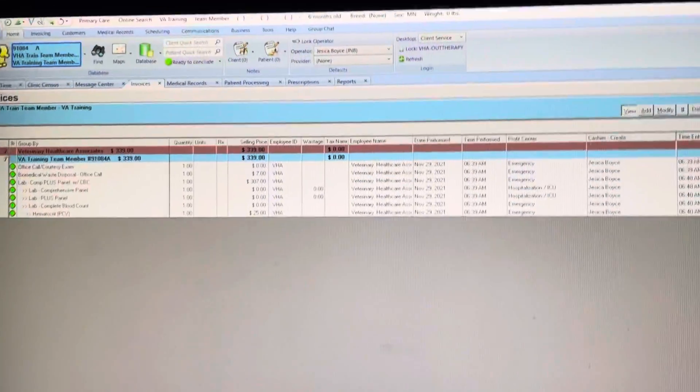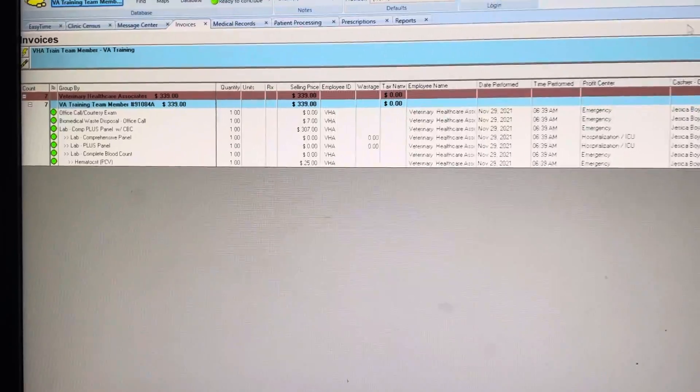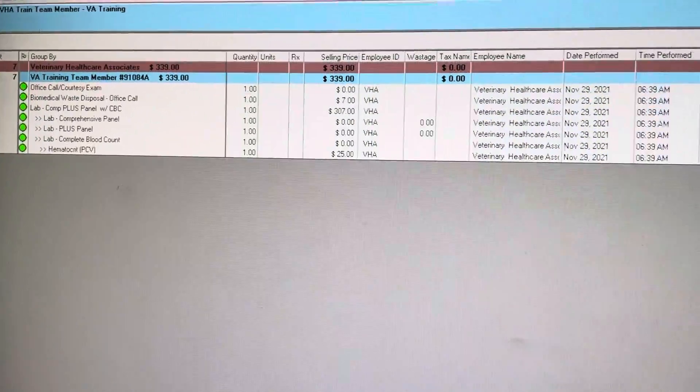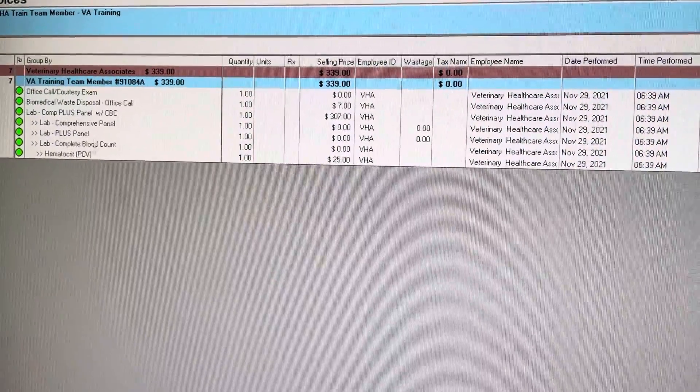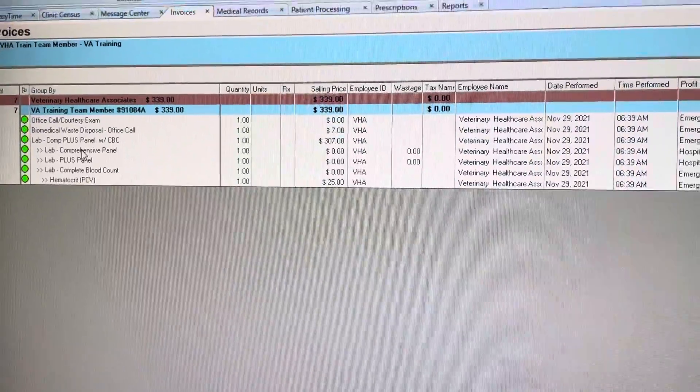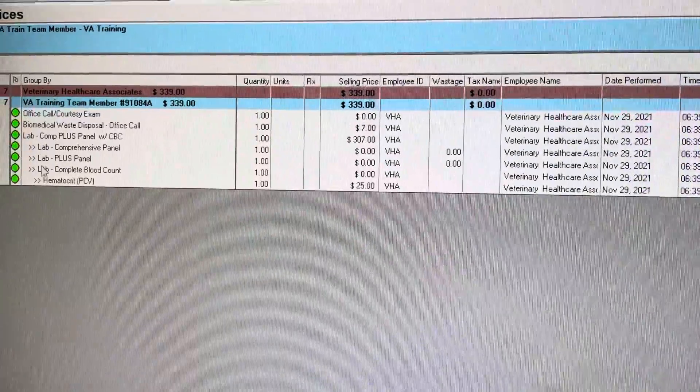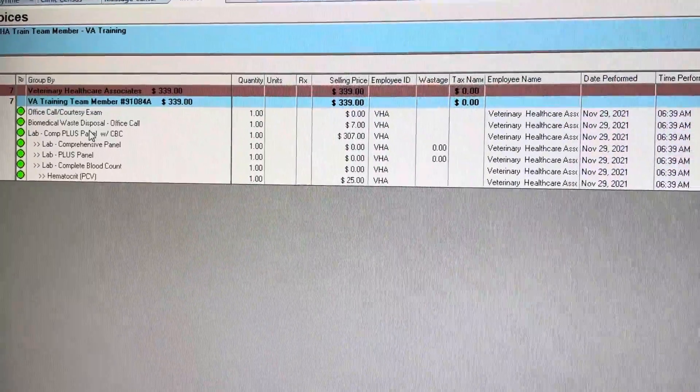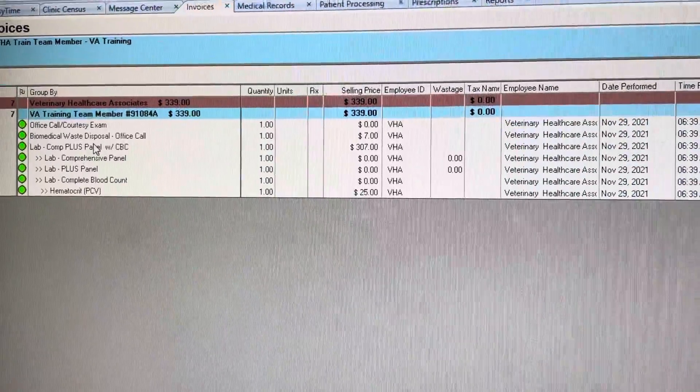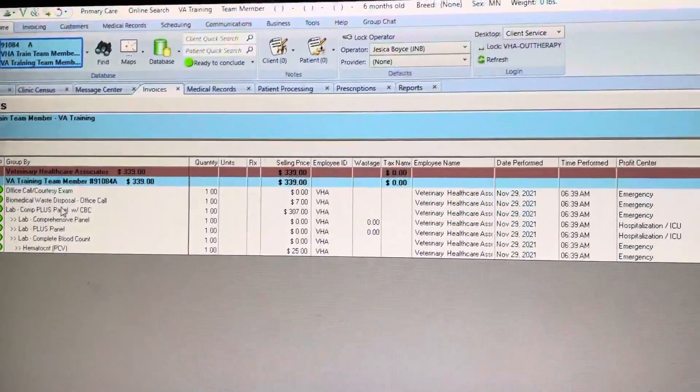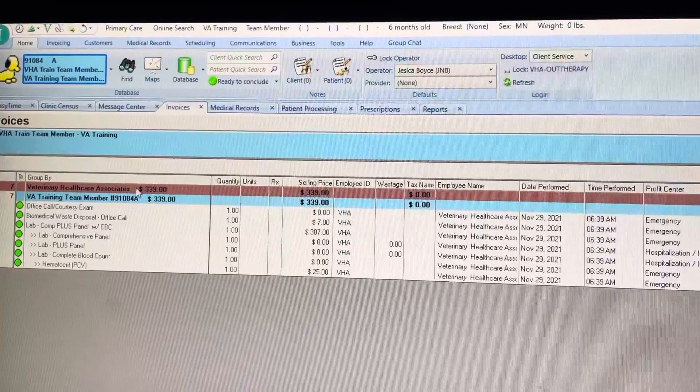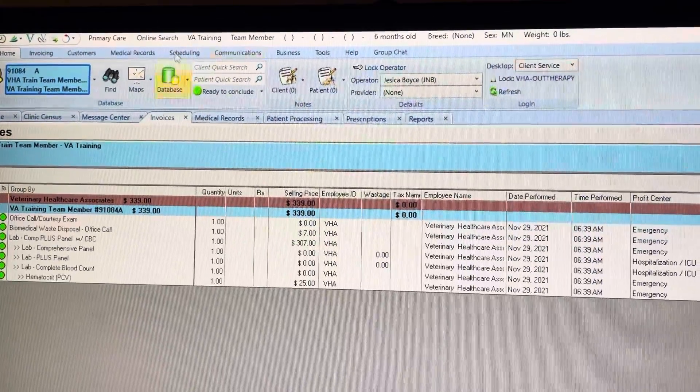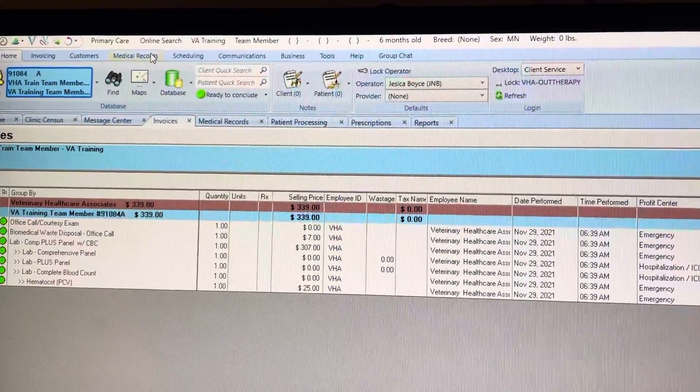Okay, so let's say you're working in lab and you're running a comp plus panel for the emergency team. If something happens and goes wrong and for whatever reason it doesn't run the test, what you need to do is go back up here to where you can request your labs.